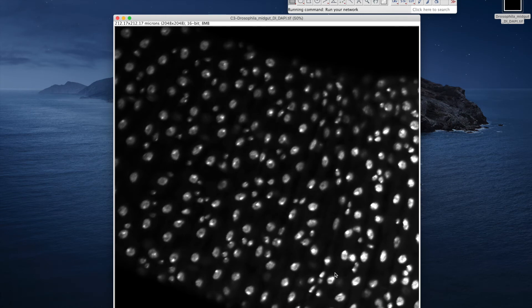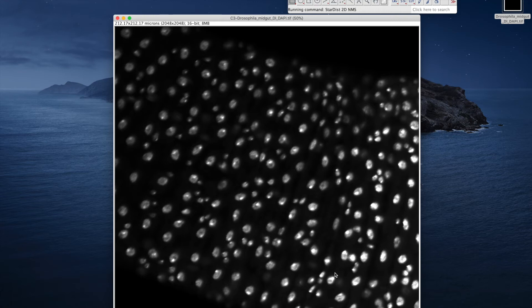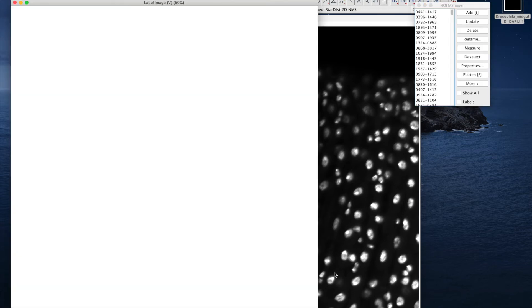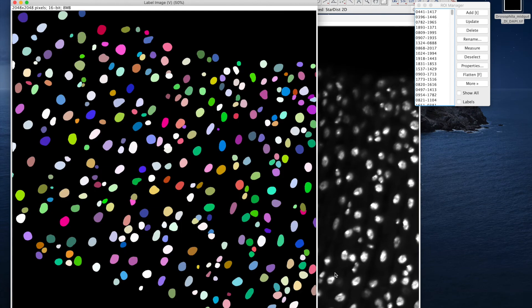Now, StarDist starts processing the image. OK, now we've got the results. This is a labeled mask of the input image.